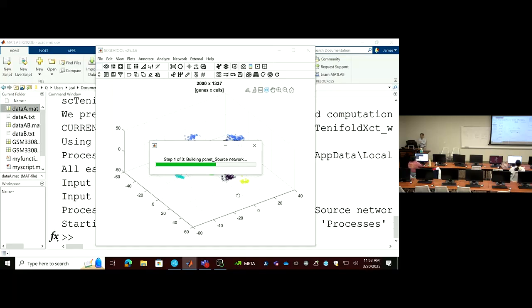So I will leave the program here and just like to finish off today's session. And let me know if you have any questions. This may finish, may not, until 12 o'clock. Okay, it should take 5 minutes or so, depending on how fast your machine is.